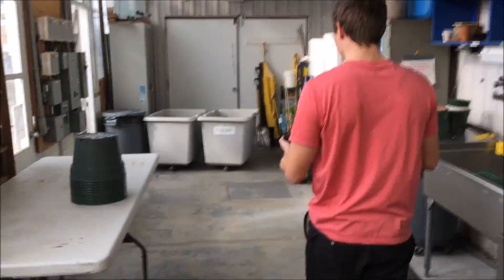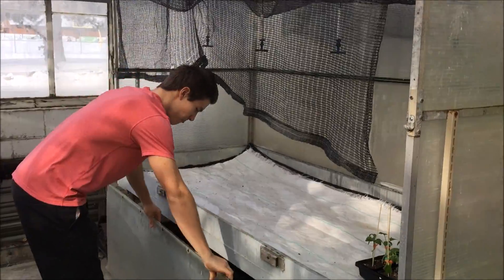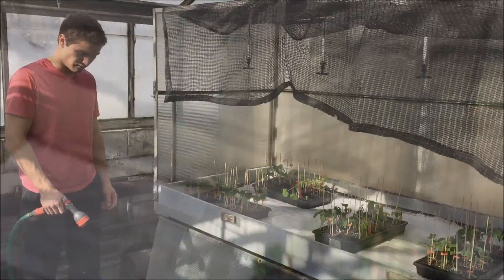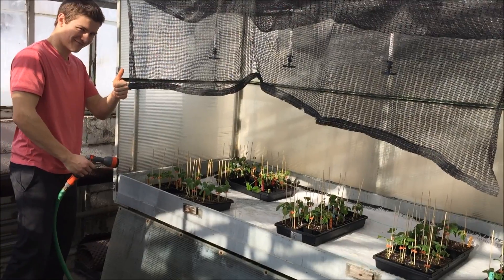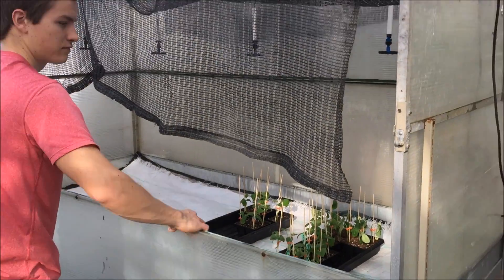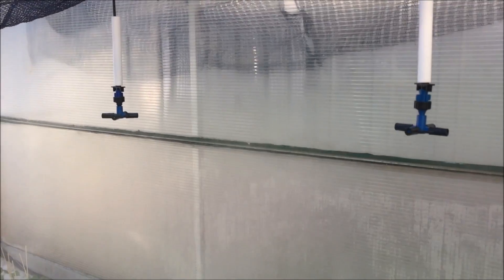When all the grafts are done, bring them into a mist frame where they will stay for two weeks. Once in the mist frame, water the plants gently. The light intensity is reduced to favor an easier graft healing. Every 45 minutes, the sprinkler waters the plants for about 20 seconds in order to keep the relative humidity high enough to limit water transpiration.